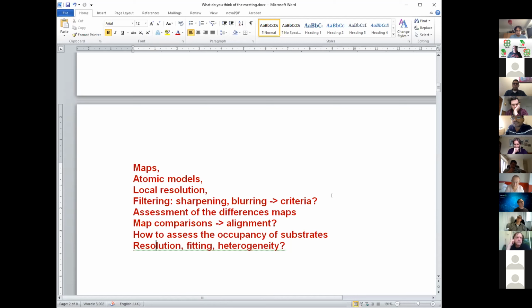Is it a user problem? Or can it somehow be fixed within EMDB? I'm not saying that, yes, they have to learn how to do that. I have to admit, I never looked at the validation reports until 2 years ago. It's okay, it's fine, it's Ramachandran, etc., etc. Everything. I've got a comment, when you're ready.